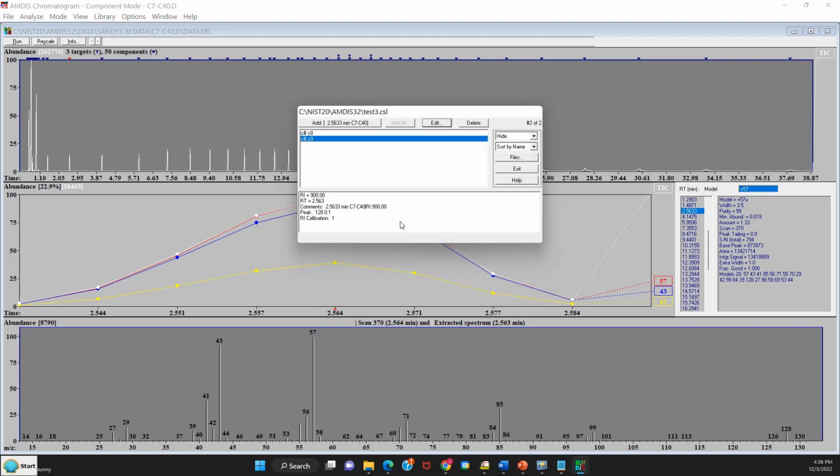And that's what I essentially did for the C8 through the C35 when I created my CSL file, and I just had to step through each one manually and add them to the file. And you can see this is something you don't want to do very often, so just either do it yourself the first time or just use my files. I have the C7 through the C35 and I have the C8 through the C35, and of course you'll always have to add the C36 through C40 manually.